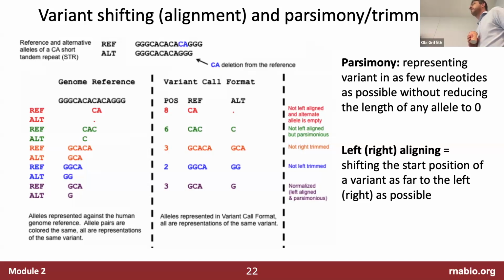It seems like it's not necessarily about priority, but, for example, say the penultimate format where the position is as far left as possible, that's a left alignment, but because it's longer, the variant is represented in a longer string. In this case, if the bottom one is indeed the one taken, does that suggest that parsimony is taking priority over alignment?